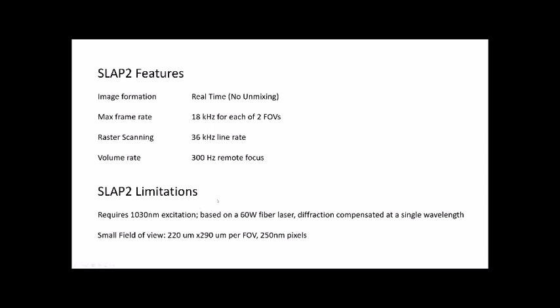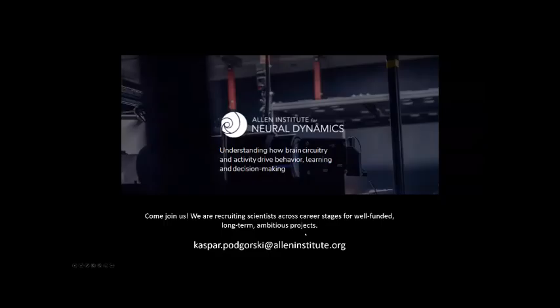Okay, this is a cool microscope. It has some cool features. It's really quite niche in that it has this limitation of 1030 nanometer excitation and a relatively small field of view. But if you're interested in dendritic and synaptic imaging especially, I'd love to talk to you more about it.